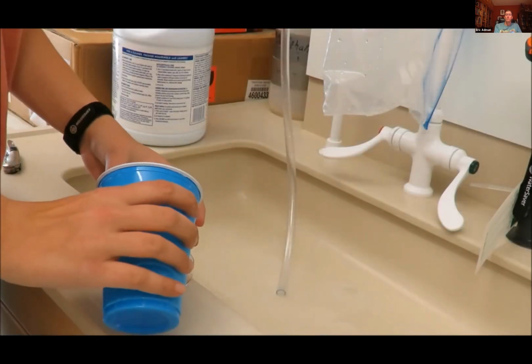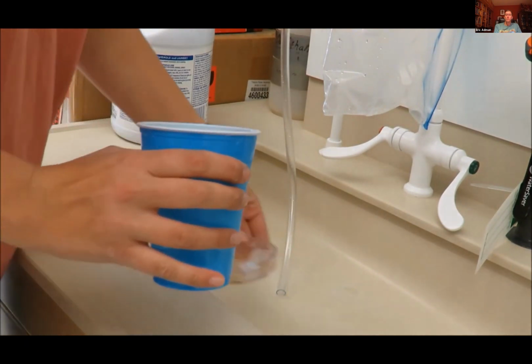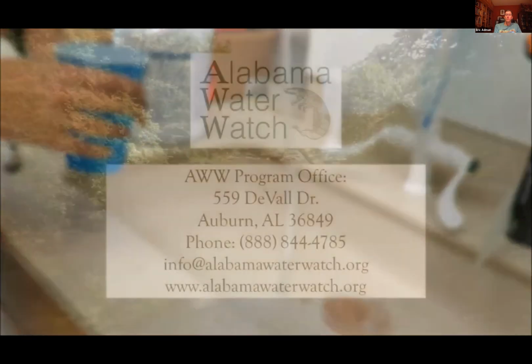Kill the bacteria by pouring about a teaspoon of undiluted bleach into the dish. Let stand for about 15 minutes, then dispose of with household garbage.